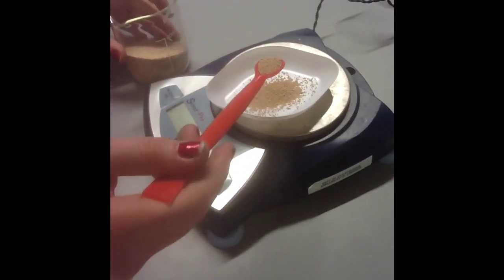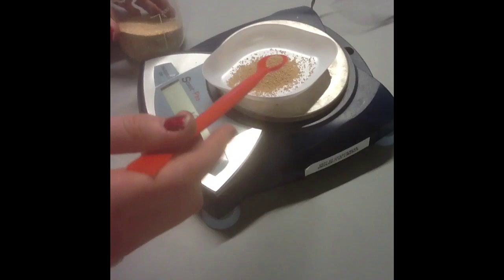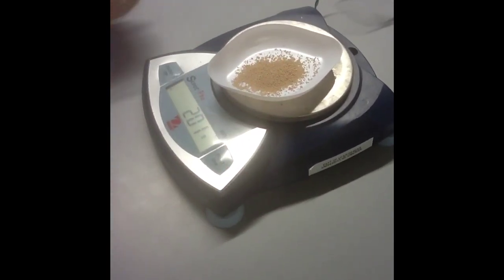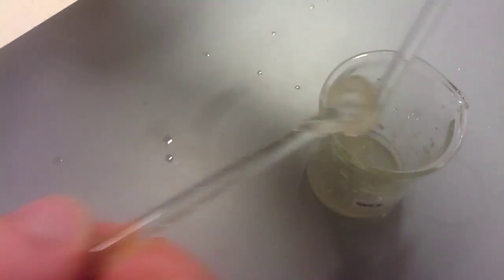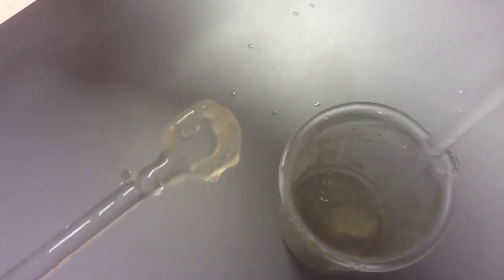The next step is to weigh out 2 grams of yeast. Add the yeast to 10ml of distilled water in a 100ml beaker. Make sure to stir well, as sometimes the mixture may appear a bit clumpy. Like so. Make sure you keep mixing until the solution turns smooth.